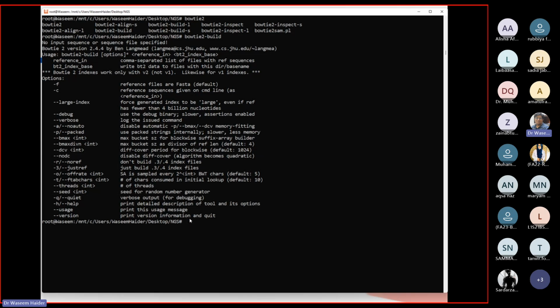So your original reference file is one, but it makes six other reference files out of it. That makes this alignment quicker, right? If there are six rooms in a house, and someone tells you the thing you are trying to find is in room number 3, you can go straight to room number 3 rather than going into all six rooms.